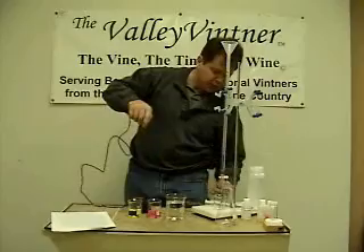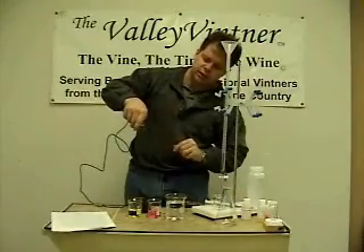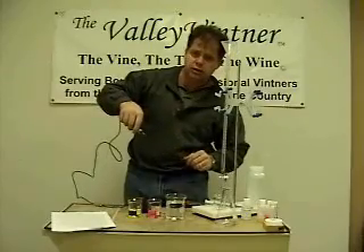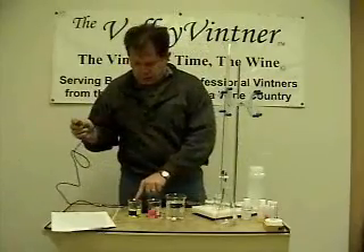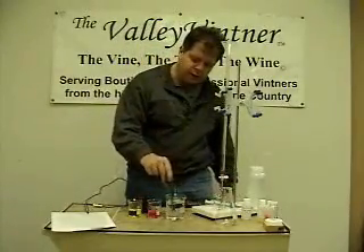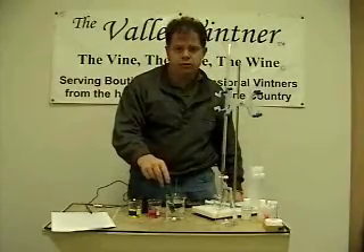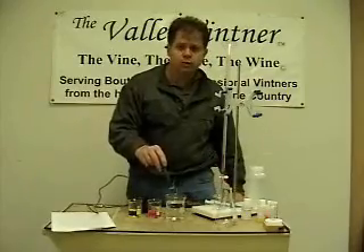Just a little housekeeping: there's a glass porous electrode on the end of this pH meter and it is delicate. You don't ever want to touch it with your fingers — the oils from your fingers will plug the porosity of the meter. Turn your meter on and rinse it in a little bit of water to rehydrate it. If it's been idle for a long time, stick it in some storage solution. But if you've kept it in storage solution, you should be ready to calibrate.